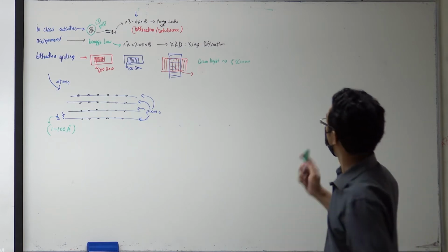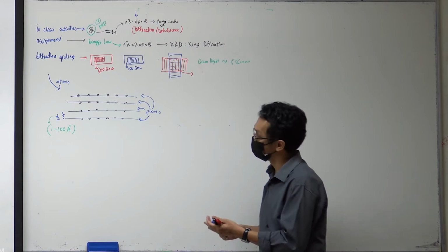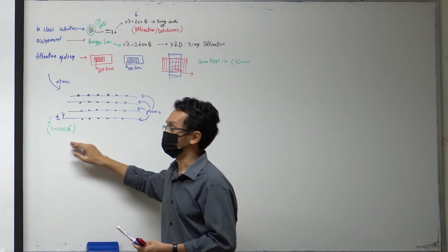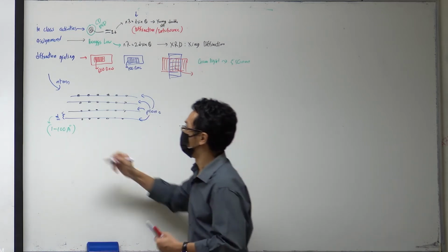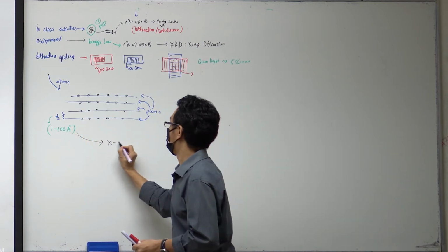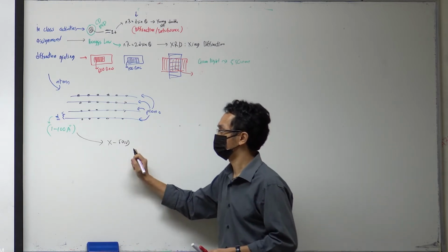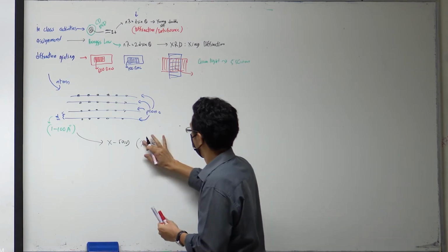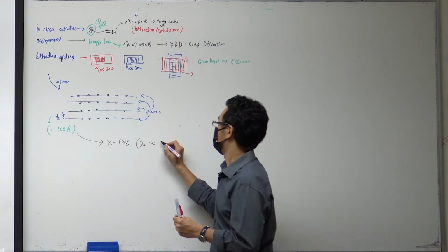So instead of using green light or ordinary light, which we cannot use here, we need something with a wavelength in this region. It turns out X-ray wavelengths are in this region. That's why we use X-ray: its wavelength is more or less similar to the distance between atoms.